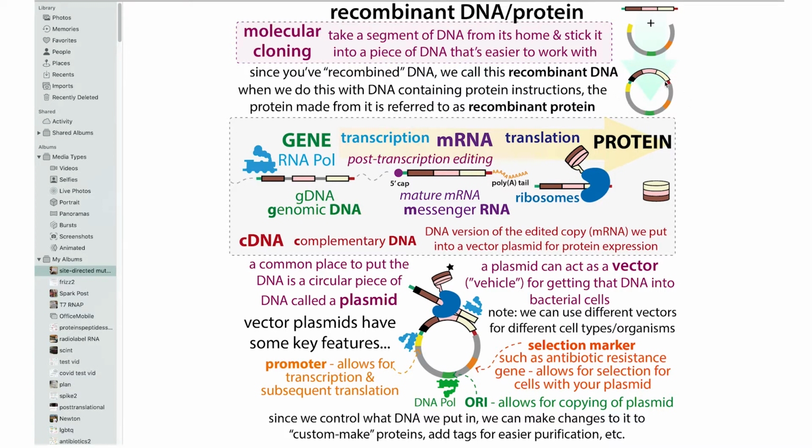Then we have this plasmid, which has our information about what protein we want them to make, and it has the instructions for the cells to actually make the protein and to copy this plasmid and all that sort of thing in the rest of this generic backbone part.